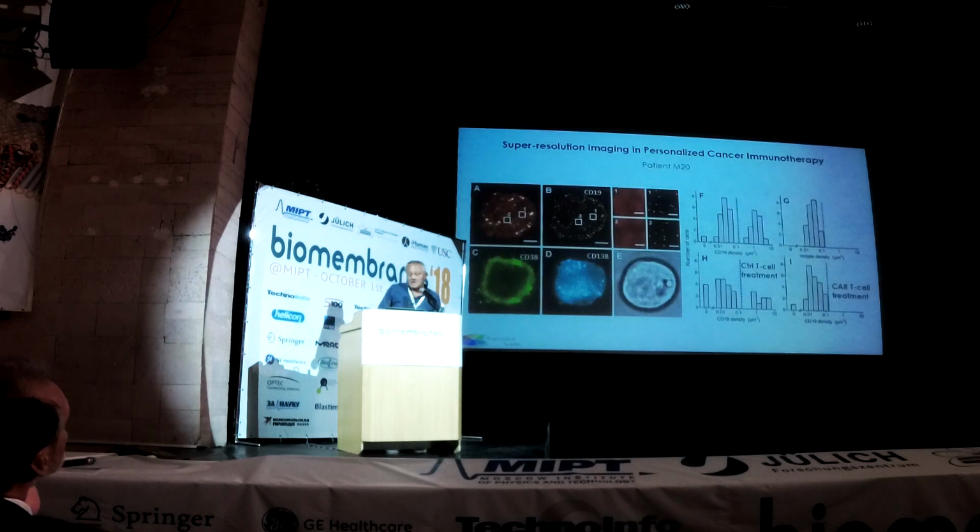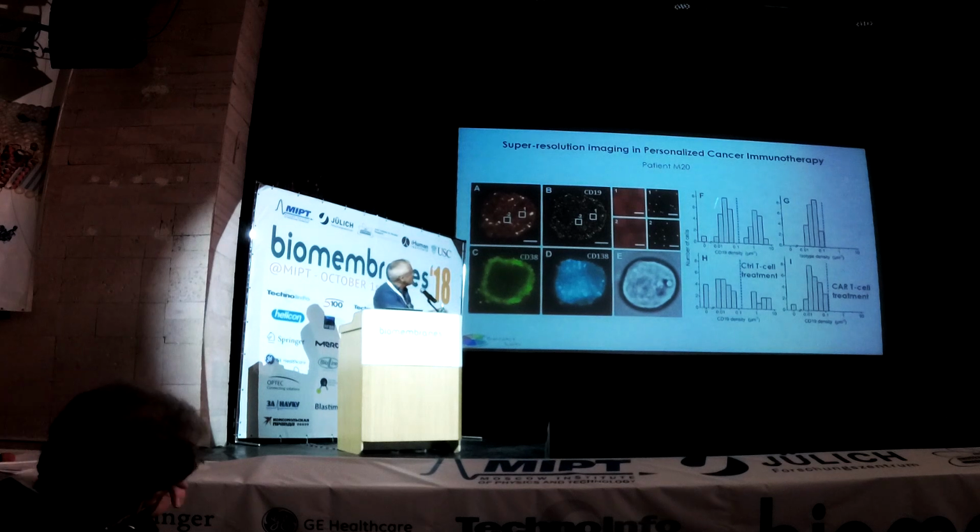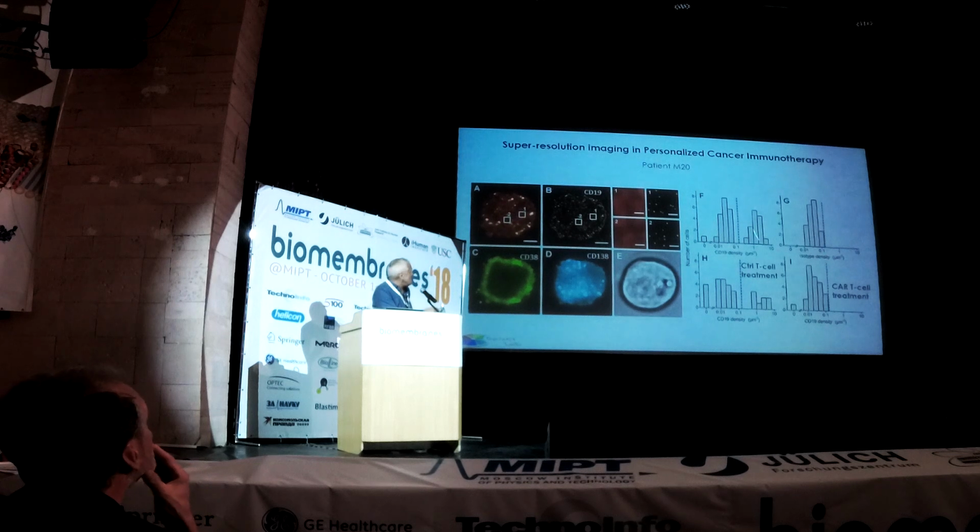Okay. Then you do quantification for different patients, and you end up with a bimodal distribution of receptor densities on these multiple myeloma cells, something around 1 and something around 0.023, something like that. Then you test other antibodies, because you can never be sure. Maybe these antibodies bind non-specifically on these cells. Maybe there is no CD19 expressed. So another isotype antibody doesn't bind, so this population disappears, and this lower receptor density population remains.